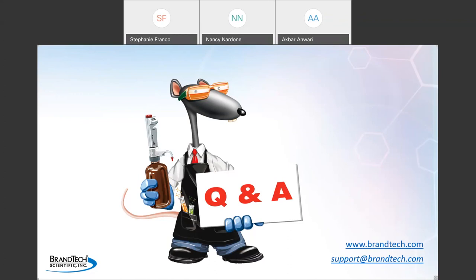That's always our first question when people tell us they're having a problem with calibration: what tips are you using. So yes, if you're having an issue with calibration and you're not using the manufacturer's tip, it's always a good idea to go back and double check with the manufacturer's tips and confirm that the pipette is performing properly. Once you make that confirmation, then you can do the calibration with the third-party tips. Sometimes, if the shape of the third-party tip is different, you may need to make an adjustment on the instrument, but always confirm with the manufacturer's tips first that the instrument is operating properly.